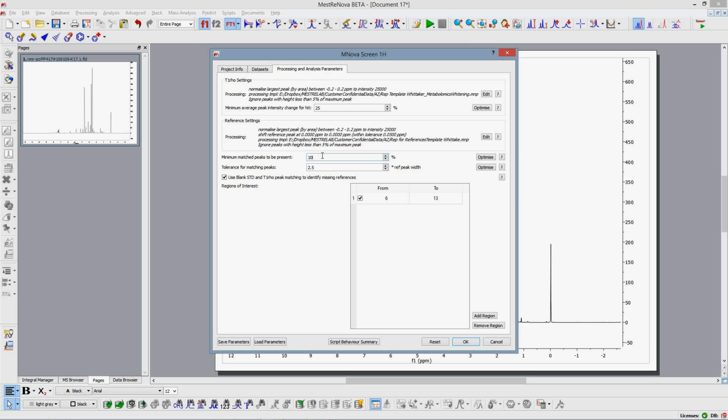I mean, for most of you who've been doing this quite a lot and you have curated your libraries, chances are that this is not going to happen very often, if at all, that something doesn't dissolve. For those of you starting, this is going to help you precisely to start curating your library, to detect when a fragment hasn't gone into solution. But you need to tell us which are the values that you are happy with.